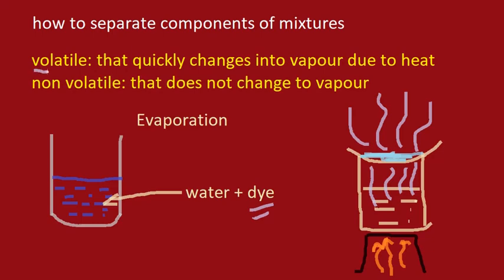This is the method of separating a volatile component and a non-volatile component from their mixture. One important point here is that we do not heat the water and dye mixture directly, because if we heat it directly there could be a chemical reaction and the chemical composition of the mixture might change. So instead we use this indirect method of heating — we put a beaker containing water, and the steam from that beaker heats the watch glass, which eventually evaporates the water from the ink mixture, leaving the dye — the coloring matter — behind in the watch glass.